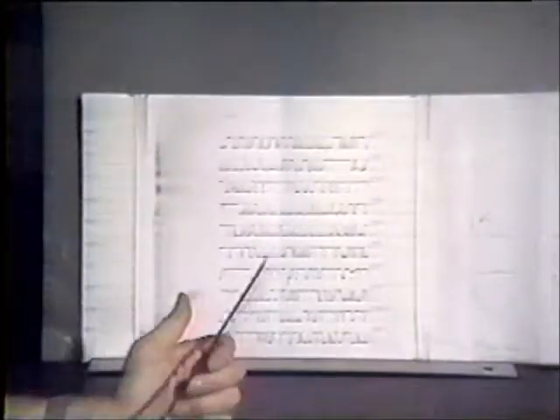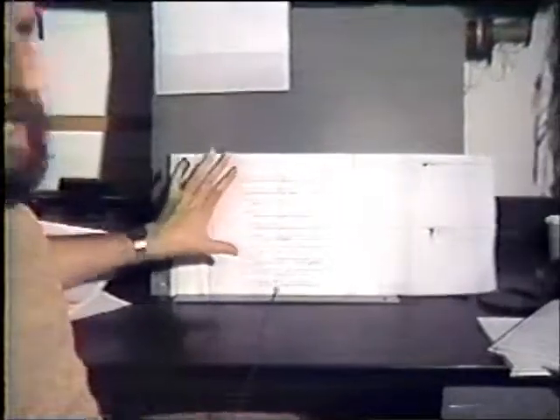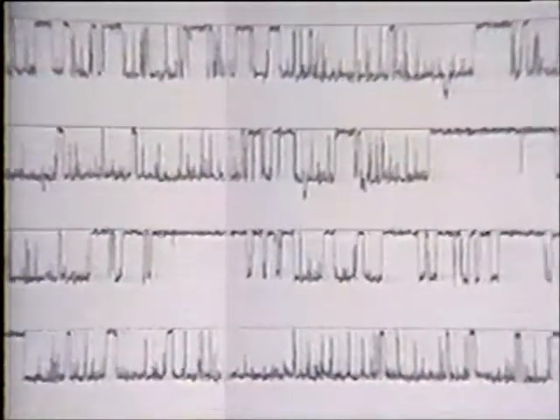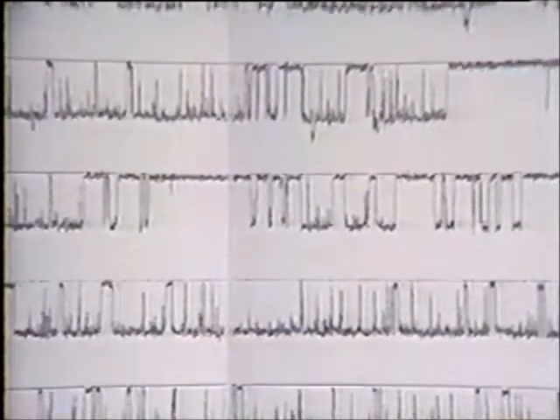This is a plot of activity from a calcium-activated potassium channel. If you were to look at this data, it looks rather pretty, lots of activity. And if you made histograms of this activity, you could get useful data out of it. The problem is, in making a histogram out of the entire record, you have to be assured that this is representative of the entire record. One output that we found very useful is a measure of data stationarity.